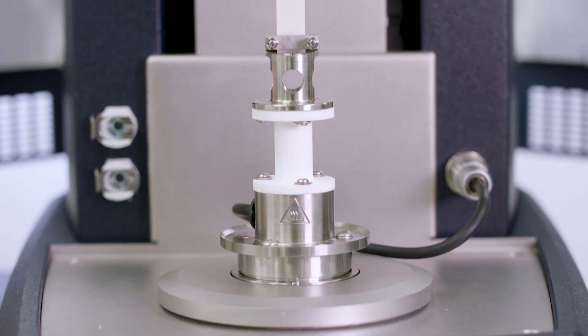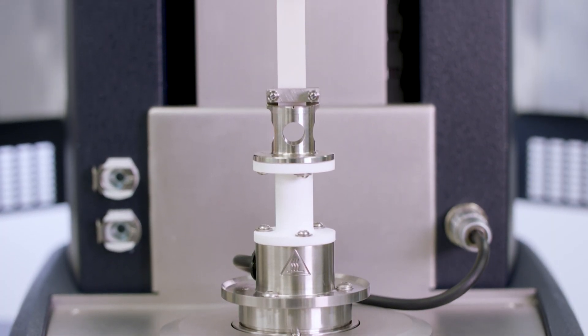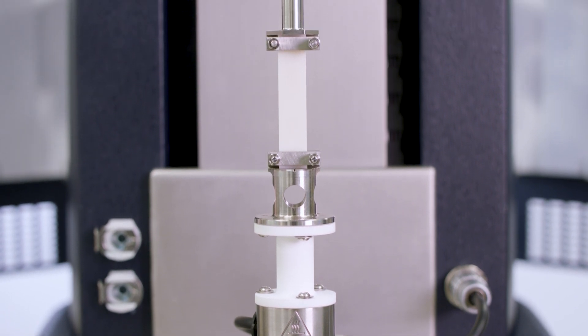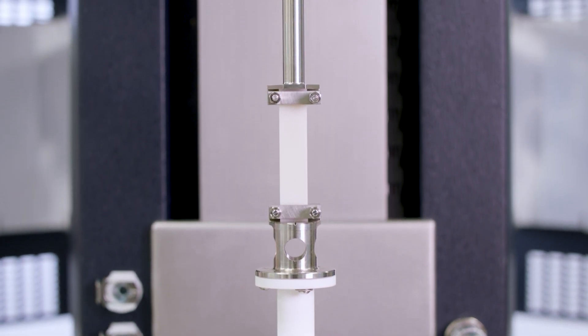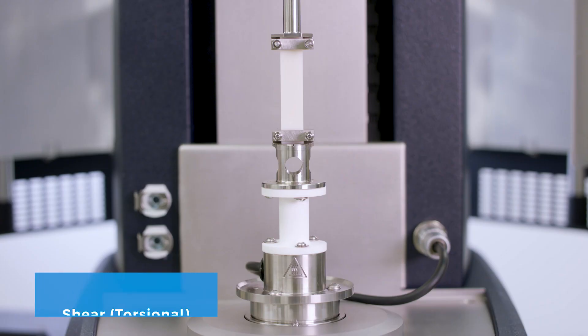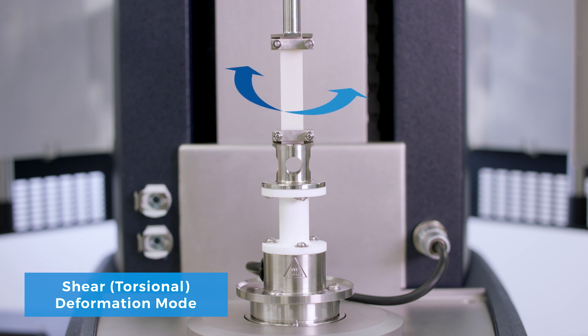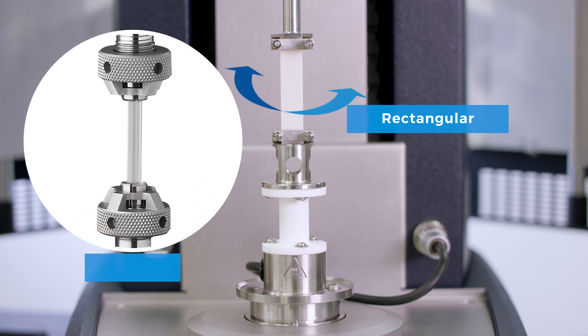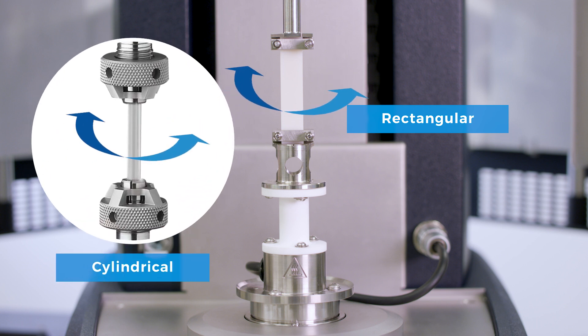First of all, if you are working with medium to high stiffness thermoplastic or thermosetting polymeric materials, traditionally this kind of samples are studied under shear deformation or torsional deformation mode using a torsional geometry. The Discovery Hybrid Rheometer can perform torsional tests on samples with either rectangular shape or cylindrical shape.